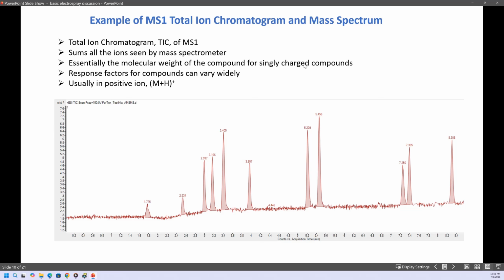Most of the ones, all of the ones that I will discuss in this course are smaller molecules, and they tend not to support more than one charge. But if you get bigger molecules, you can get doubly charged compounds, and then the mass observed will be half because the charge is 2. But in our case, essentially all will be a charge equal to 1.